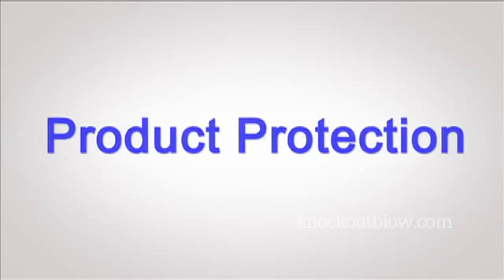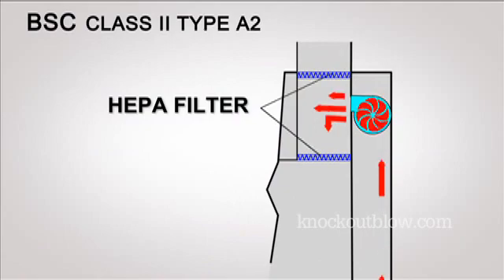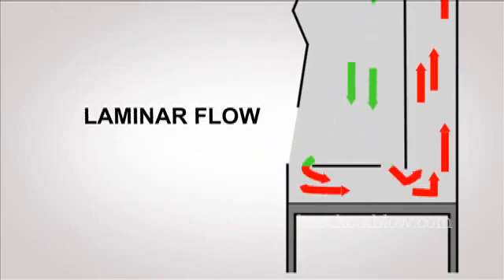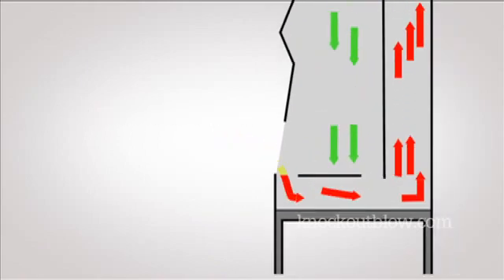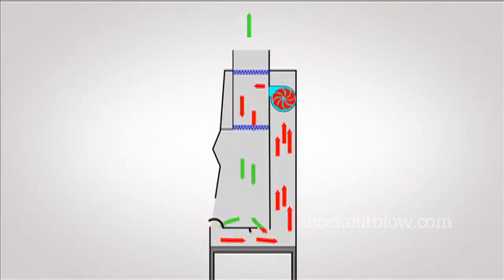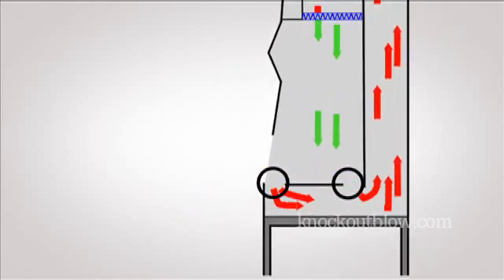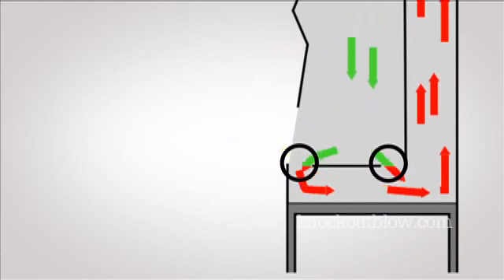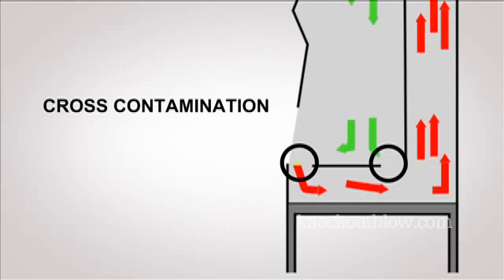Product Protection: The downward flow of HEPA filtered air across the work surface of the cabinet in a single direction at a constant speed or laminar flow. The downward moving air flow splits as it approaches the work surface. The fan draws part of the air to the front grill and the remainder to the rear grill. This split generally occurs about halfway between the front and rear grills above the work surface to prevent cross-contamination.